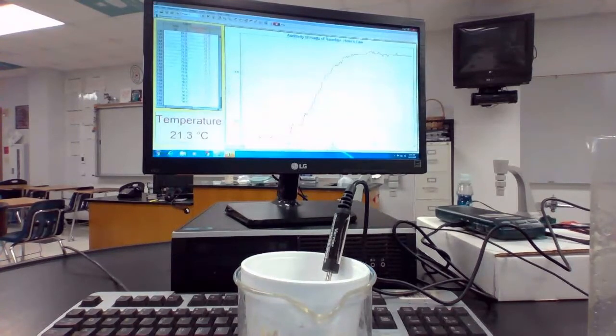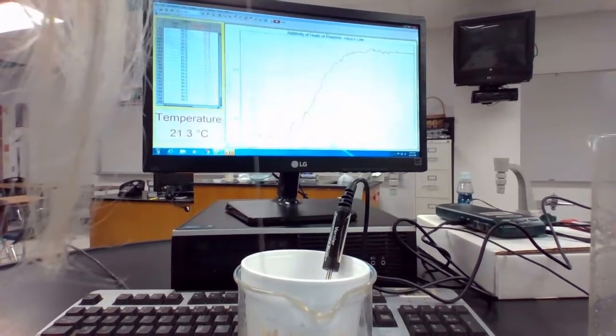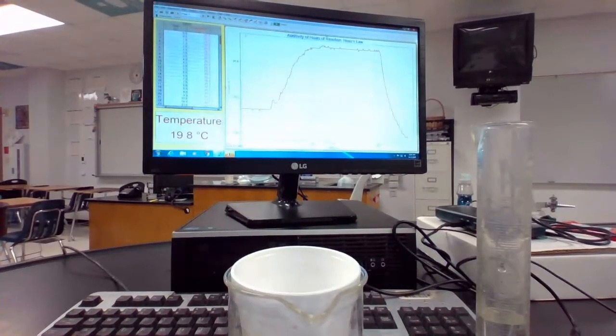Yeah, our plateau is relatively flat. We can honestly say that our highest temperature, we're not going to have to extend our lines and do anything because we do not have a dip in the plateau out here. So our highest temperature came out to 21.3 for this reaction.